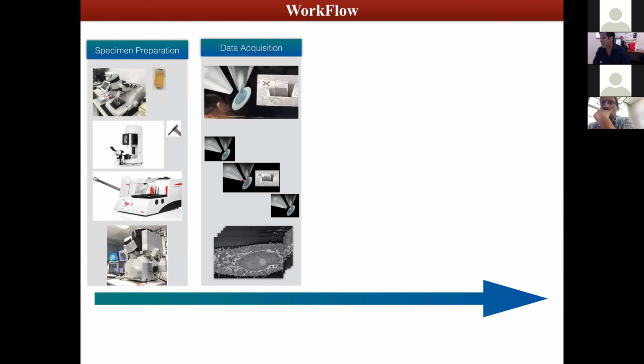This is one of my data sets on a biological science sample, but keep in mind that the stack of data that you are going to get is not just a few tens or a few hundreds of images. Those are in thousands of images. And a data set is going to run crazy, something like 2 terabytes, 3 terabytes, or 5 terabytes, if you really want to do a very in-depth analysis of a sample that is, say, a few microns thick. Usually the instrument runs overnight and collects the data.